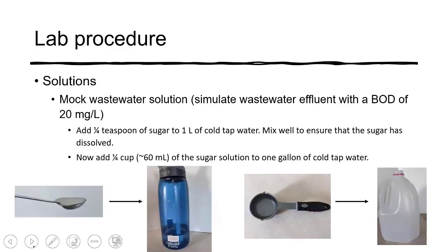Now you'll need to make up 2 solutions. One is a mock wastewater solution. So what I've tried to do is to simulate a wastewater that has a BOD of 20 milligrams per liter. I calculated the BOD of a sugar solution.